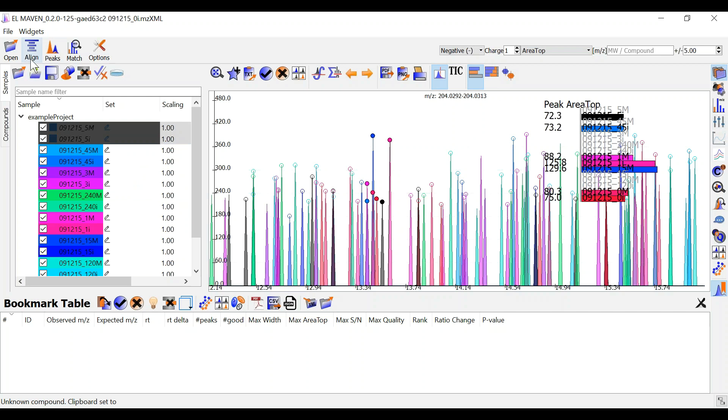You can perform alignment to correct for the rt drift across your samples. Alignment shifts the peak retention times in every sample to correct for this drift and brings the peaks closer to median rt of the group.